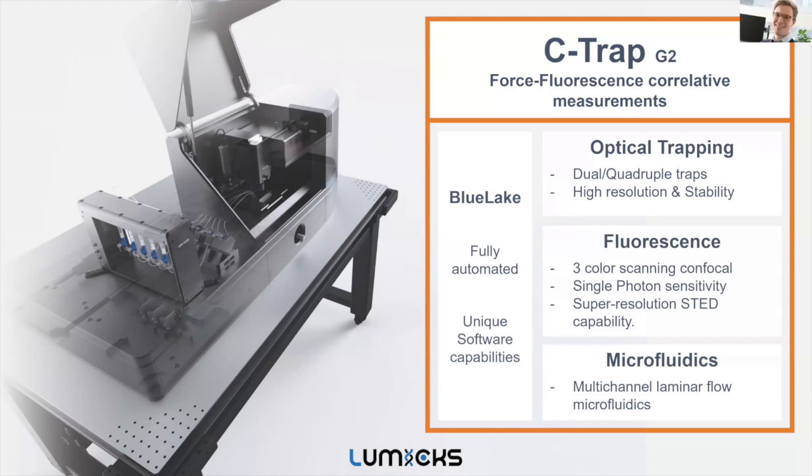I think it's also important to add that once you load in the samples, it's all on a closed system. So you just clean it and you reuse all the components. And I think there are also a few C-Traps that are in biosafety level 2 labs. So as long as you can get it in the lab, I think it should be fine.